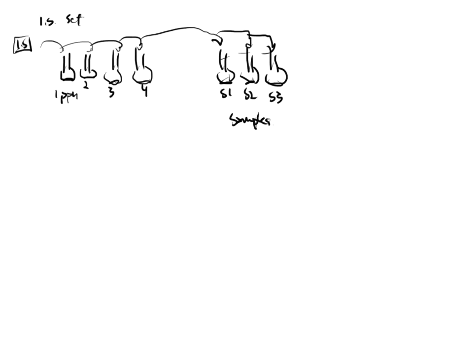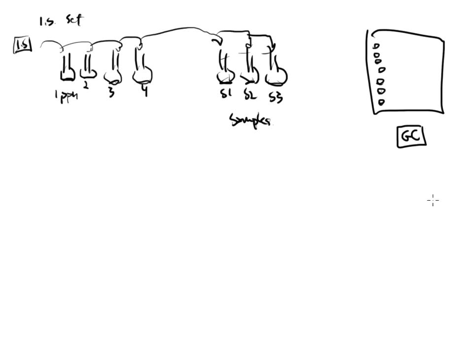So I'm going to take all of these to an auto sampler tray. 1, 2, 3, 4, 5, 6, and 7. 1 through 7. I've loaded up my standards. I've loaded up my samples. And I've gone to a GC instrument, gas chromatography. And a GC auto sampler uses a needle, and that needle is going to puncture into each one of these vials, and it's going to shoot a sample into the machine, and we're going to get data.